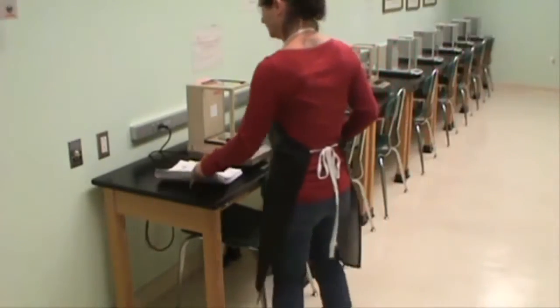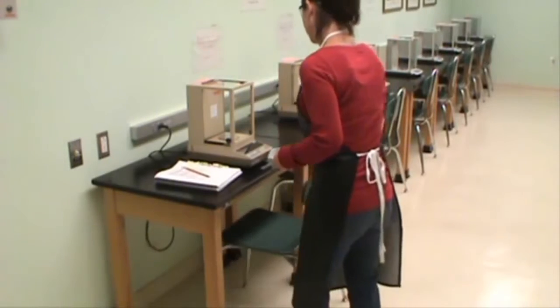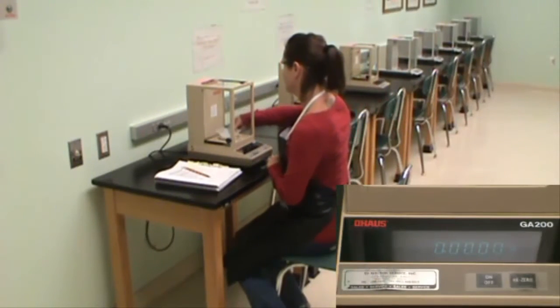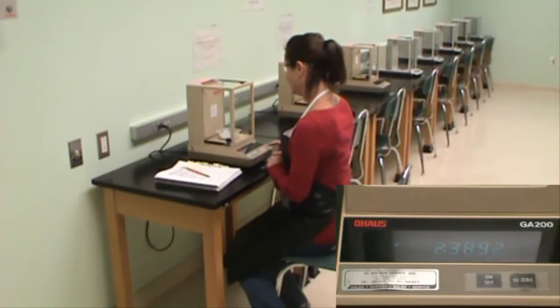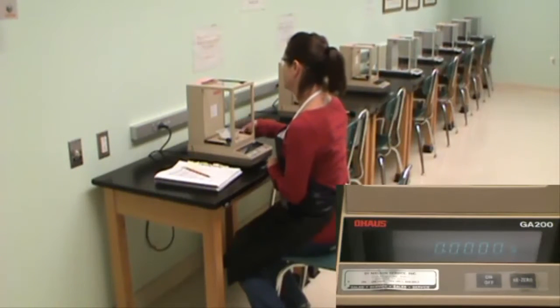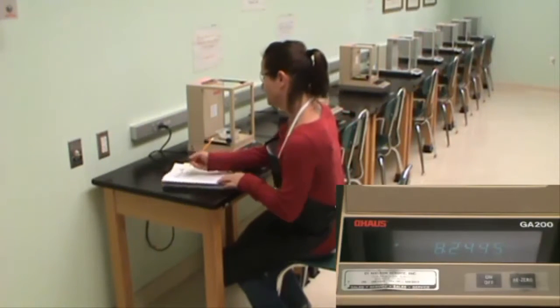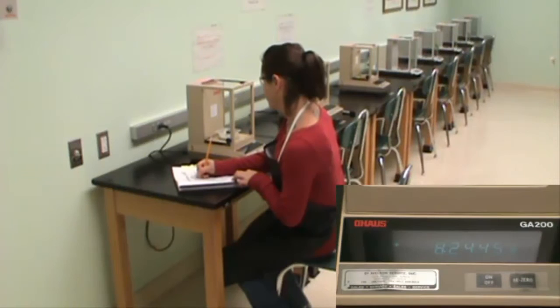When using the balance, take a seat. Open the glass pane on the side, place the weighing boat on the balance, close the glass pane, and once the reading stabilizes, push Re-0. Once the reading shows 0, open the pane and place the rubber stopper in the weighing boat. Close the glass pane and record the first number you see that is stable and the letter G for grams is showing.